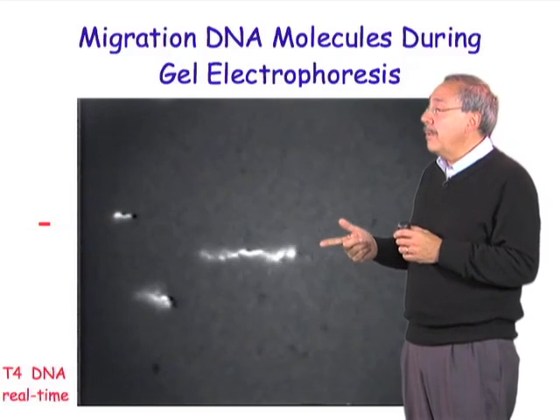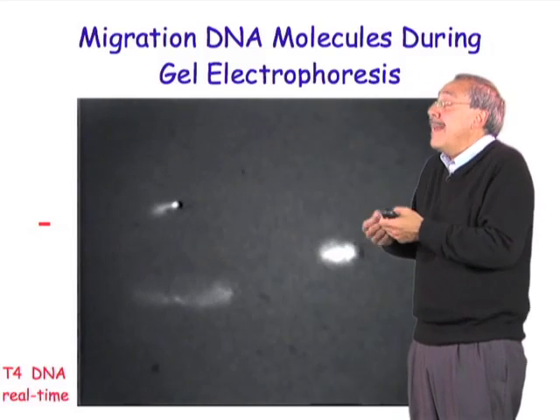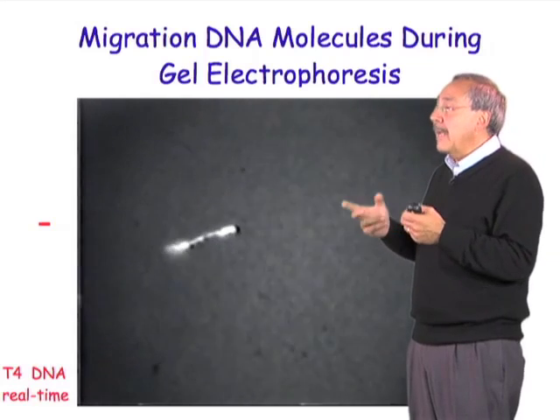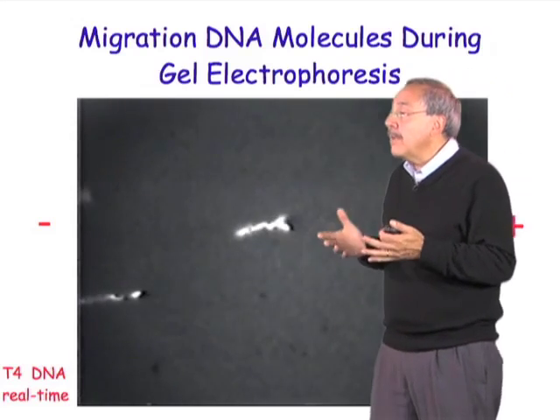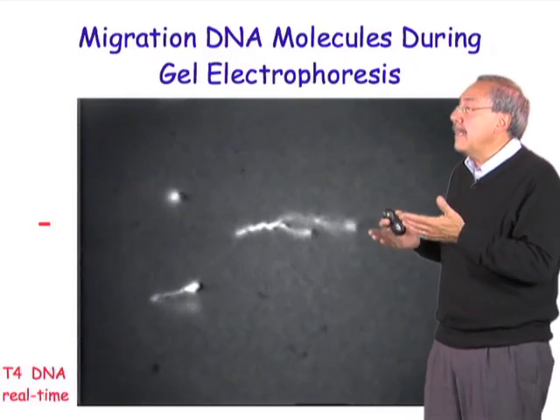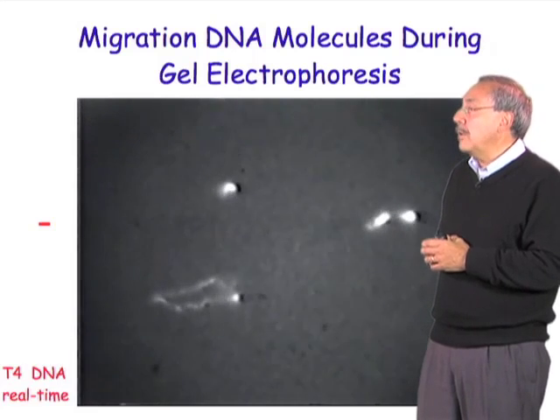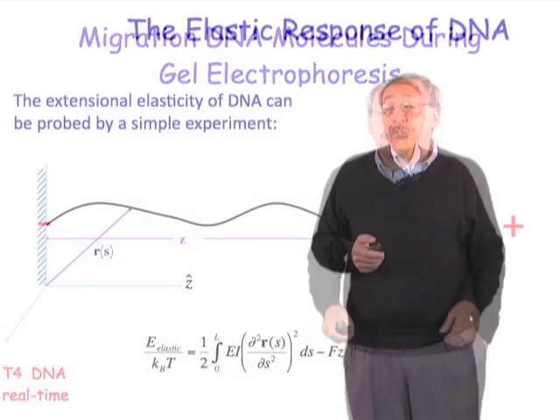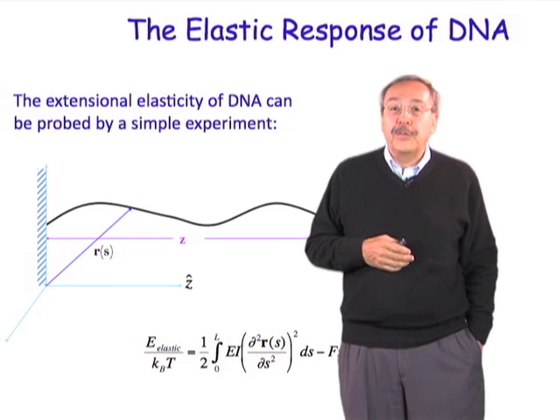This repeats over and over, but what I would like you to notice is how, when the collapse occurs, how elastic the molecule appears when the collapse occurs, right? In other words, when that particular arm turns the corner, notice it catches up very fast. And that really surprised us quite a bit. We, in fact, knew about elasticity, but seeing the elasticity at play actually was a great motivation. And so we thought, why not actually trying to understand the elasticity of a single molecule of DNA? So we decided to actually do an experiment to study the elasticity of a single molecule of DNA.